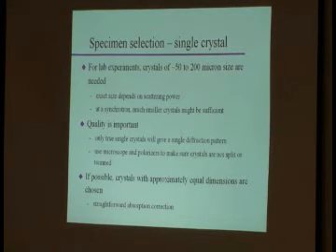This is for a lab source. At a synchrotron, you can run much smaller crystals, okay? I have heard that people have run crystals that were 1 micron by 1 micron by 1 micron as a single crystal at a synchrotron. And so you start wondering, what's a powder, what's a single crystal? That would qualify as a pretty good powder. Can you do it with a protein on a 1 micron crystal? No. That's not a single crystal for a protein. But for small molecules, it could sometimes actually work.